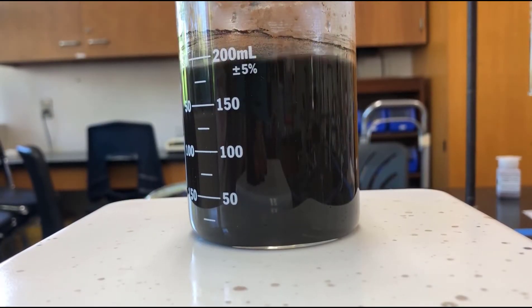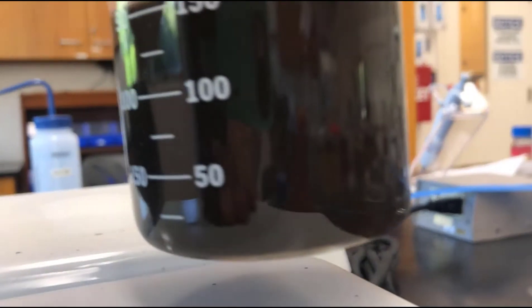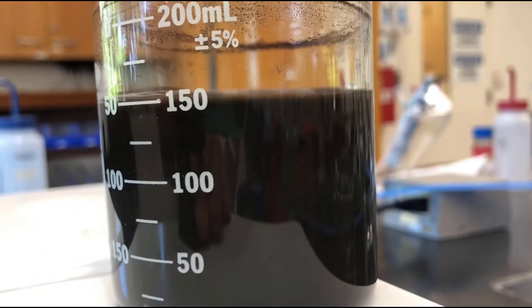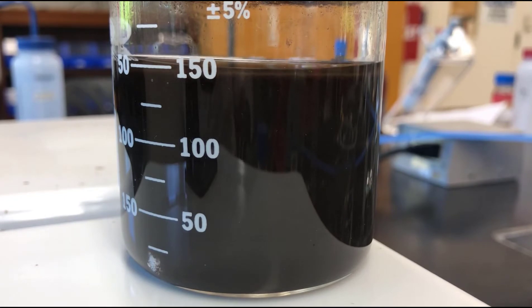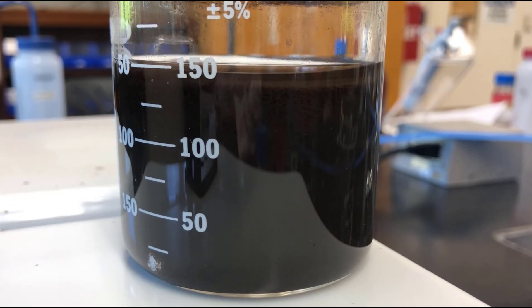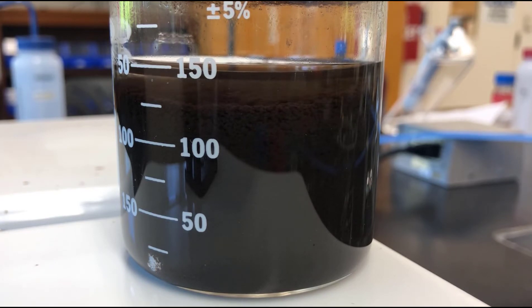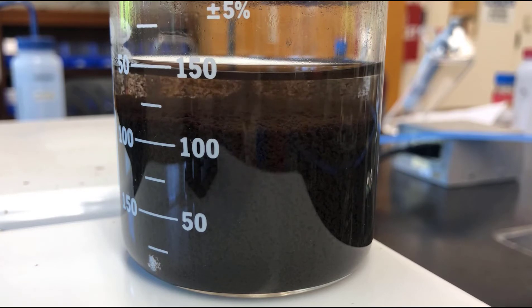We've heated this up some more, so we'll turn the stirring off and you can see it settle. We'll place it over here and keep an eye on it to see if it doesn't settle out a little better than it did the first time. It's just the momentum of the water carrying the crystals around still.